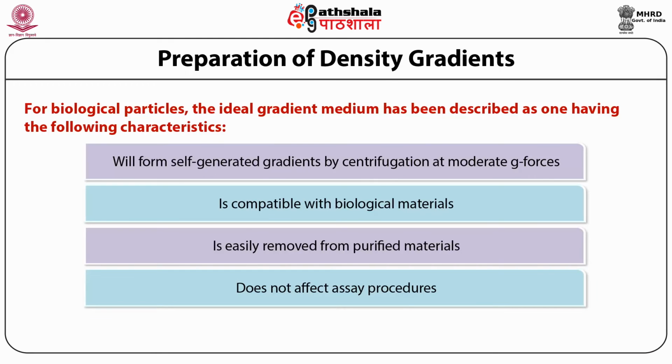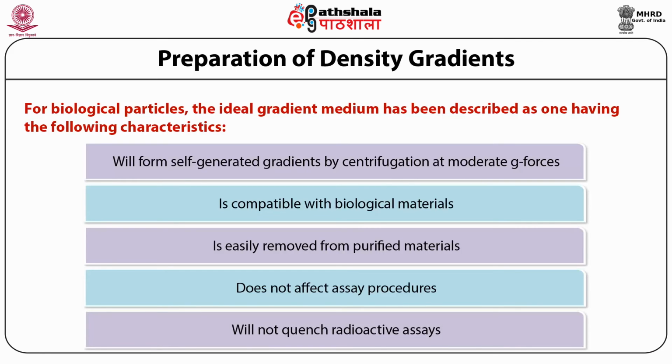It does not affect assay procedures, because it should not act as either a substrate or a product, as that would interfere with the analysis. That's why it should not affect any assay procedure. And it should not quench the radioactive assay, because it will again create a problem during the analysis. That's why it should not absorb light or radiation. It should not create any problem with the radioactive assay.